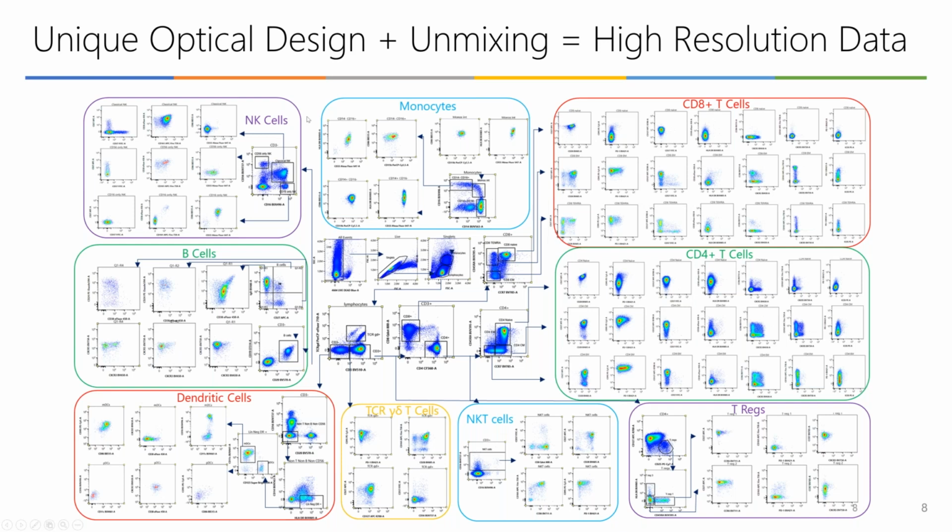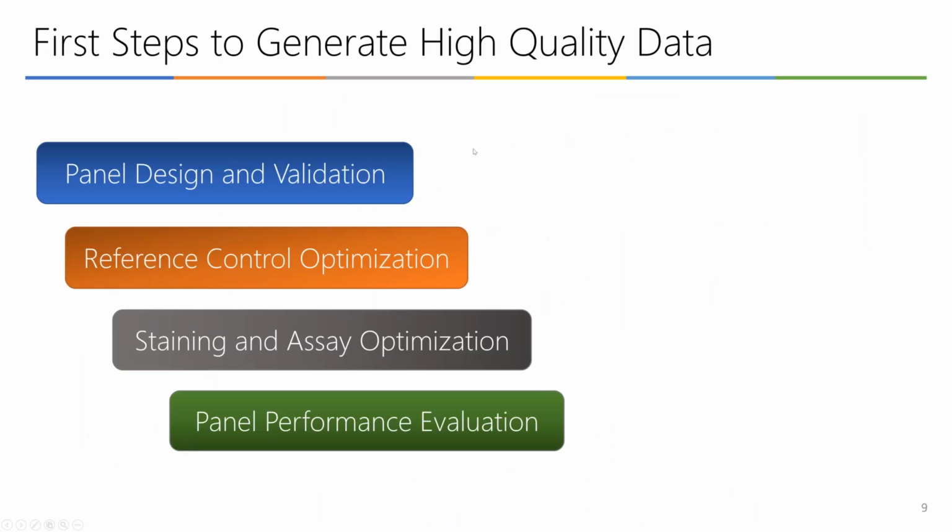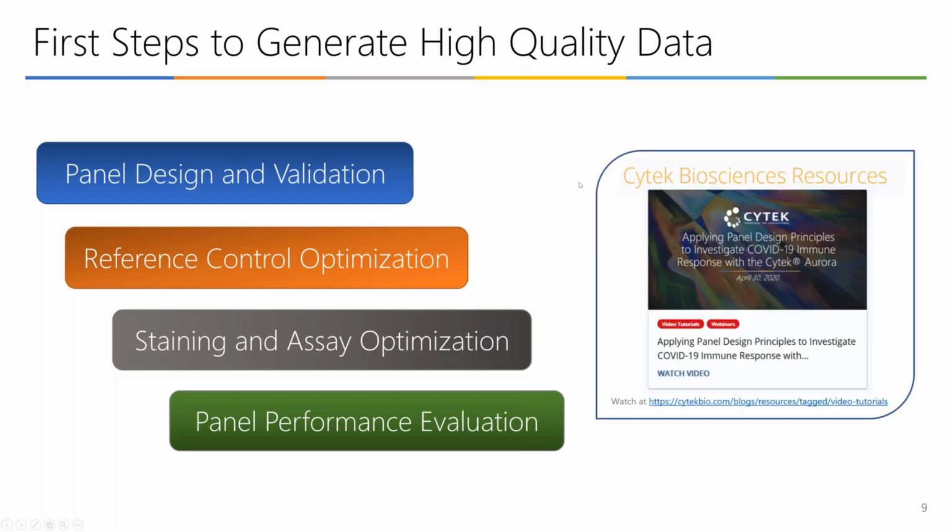So the goal for this workshop is to show you examples of computational tools that are commercially available to visualize this high-dimensional data set in a more explorative way. The first steps to generate high-quality data were already covered in our previous webinar by Dr. Maria James, and here's the link in case you want to learn more about it.